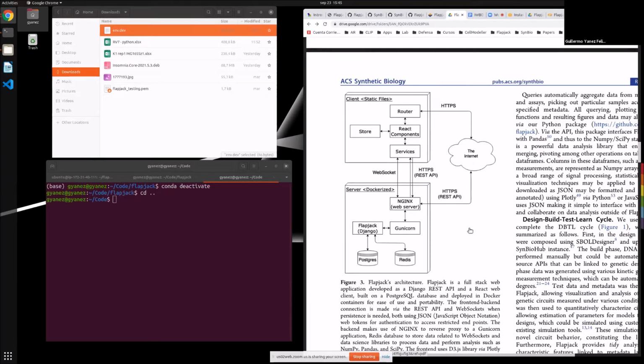All of them have the same full stack structure, architecture, which is first the backend, which contains the database and the functions, and then the front end, which just makes requests to this backend.